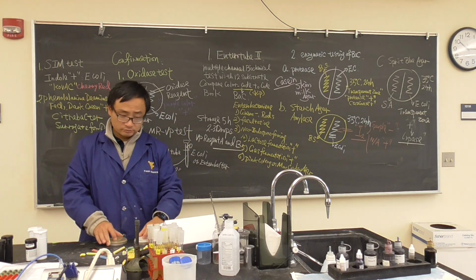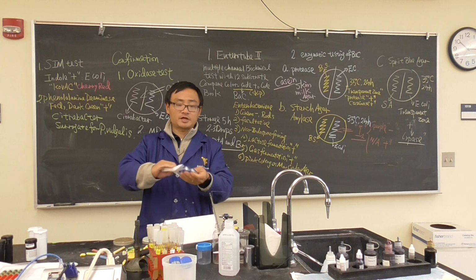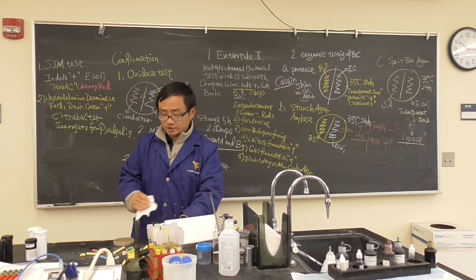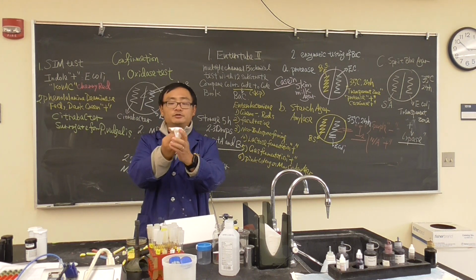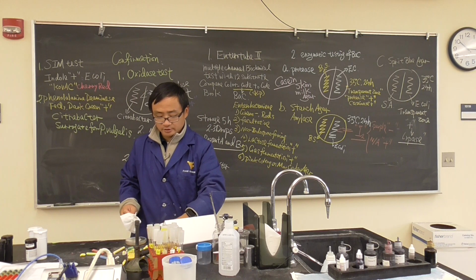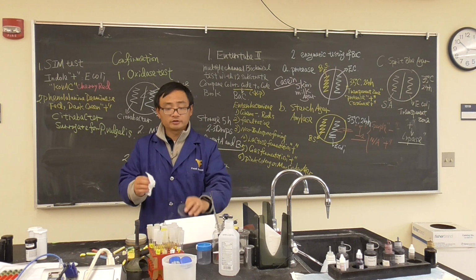Okay, if you don't know, what do you do? The first thing is to label. Make sure the outside is dried. Label it if you don't know: name, batch number, and the bacteria you're going to put there. And don't forget, the inside, please dry it a little bit also. Remember, the inside of the agar, please dry it. These have been there for a while. Otherwise, this condensed liquid, called capillary water, will damage the agar.